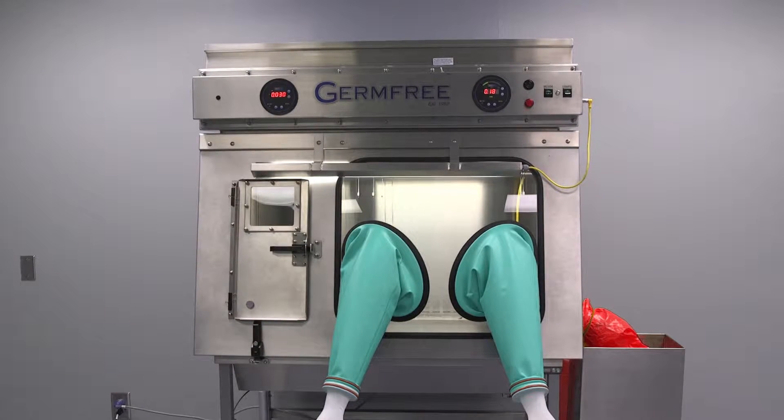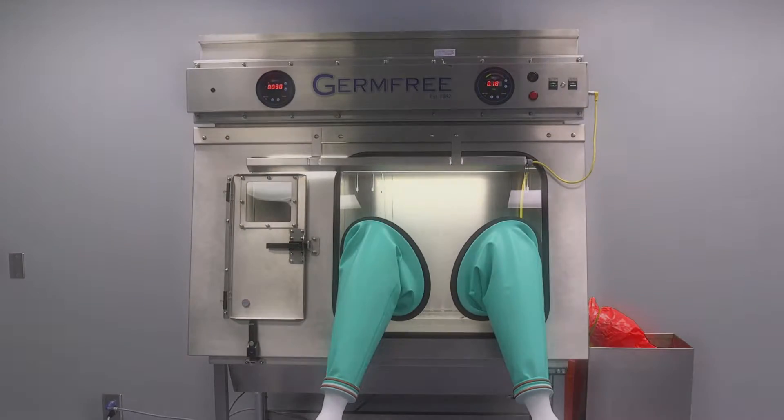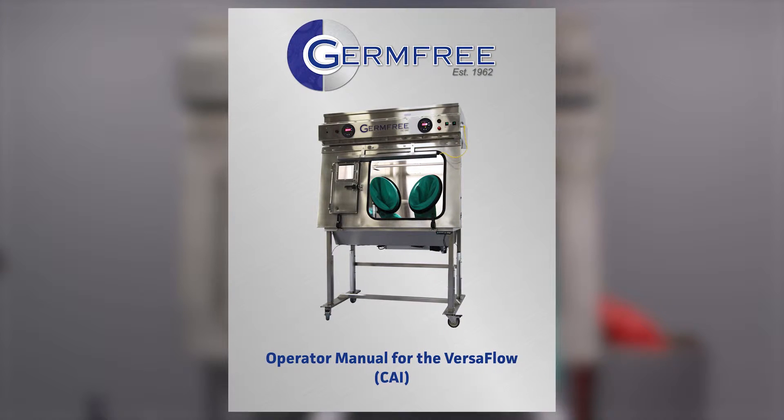The Versaflow is a state-of-the-art compounding aseptic isolator for compounding pharmacies. This video covers the five steps needed to prepare your Versaflow for operation.